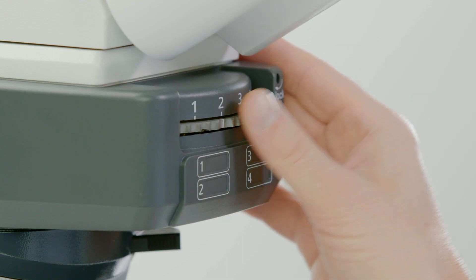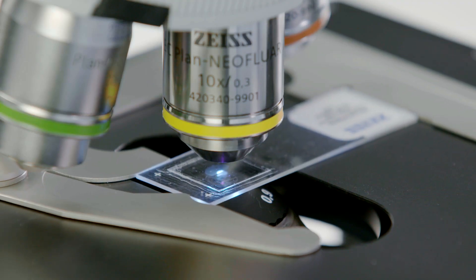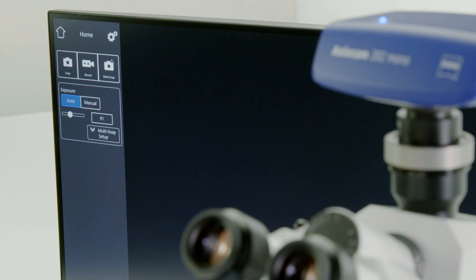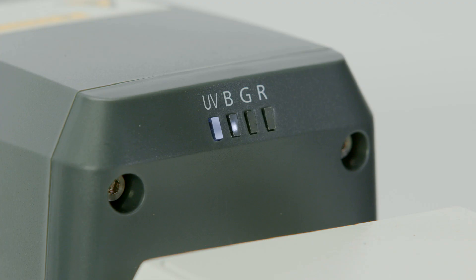Switch to the reflector position containing an appropriate multi-bandpass fluorescence filter. Then define the relevant fluorescent LEDs for excitation suitable for your sample via the on-screen display. For the sample shown, it is UV, blue, and green.